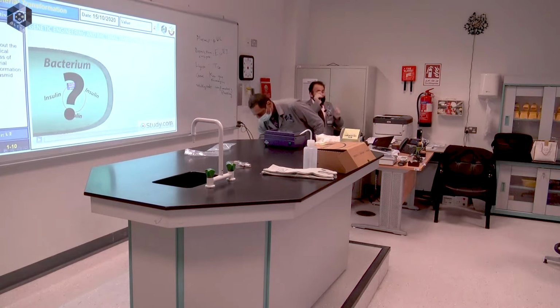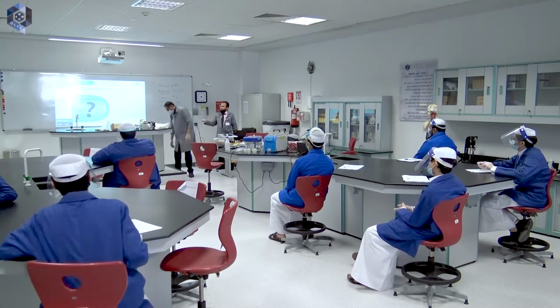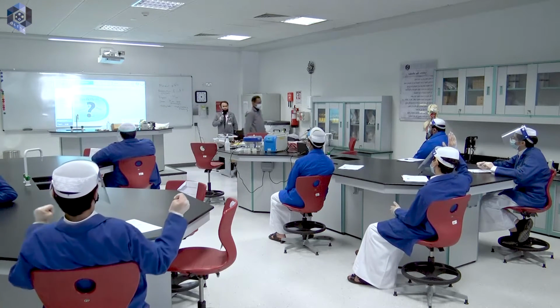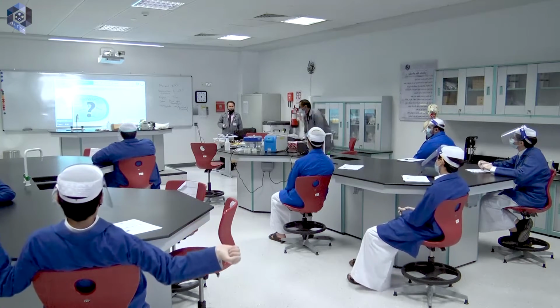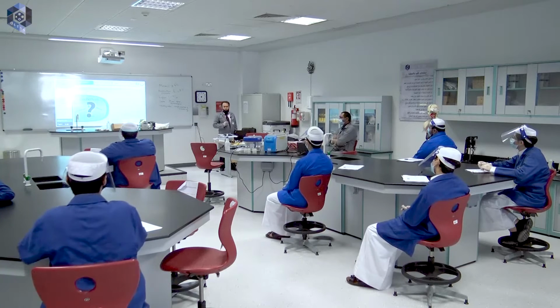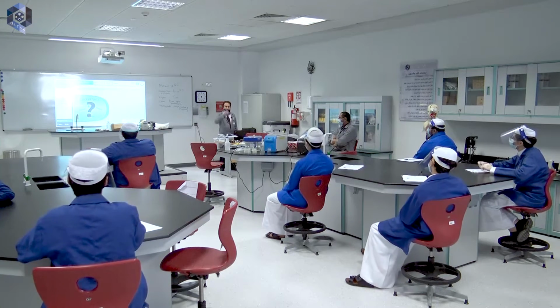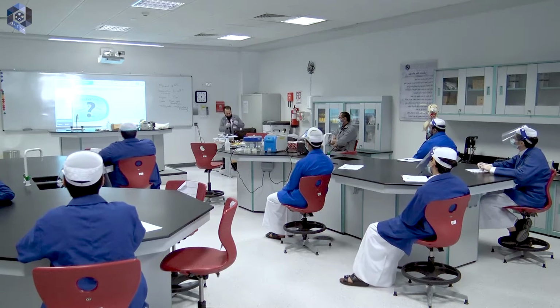Now, how is this step applied to our experiment? What kind of plasmid are we using? Name the plasmid. Yes, pUC. Now, what gene are we going to clone? The kanamycin gene, exactly.